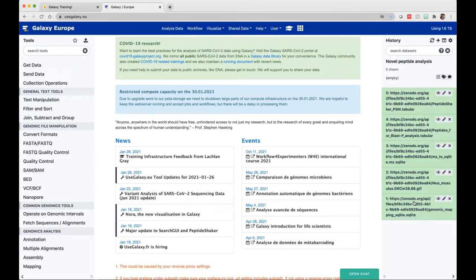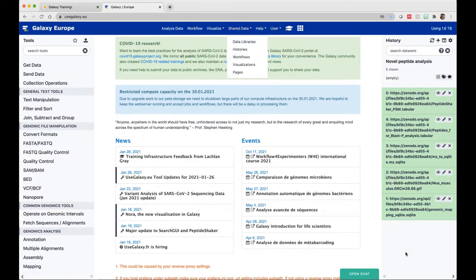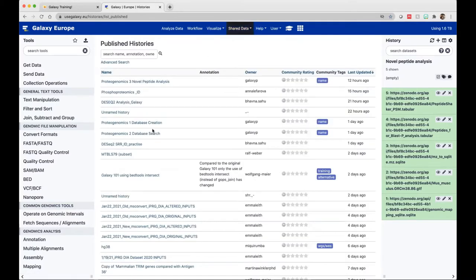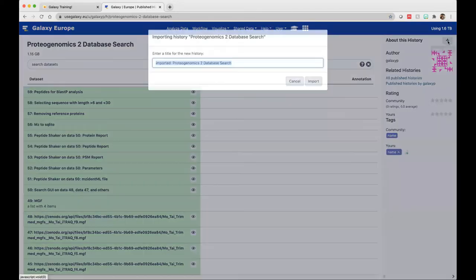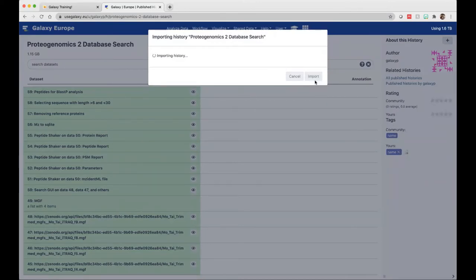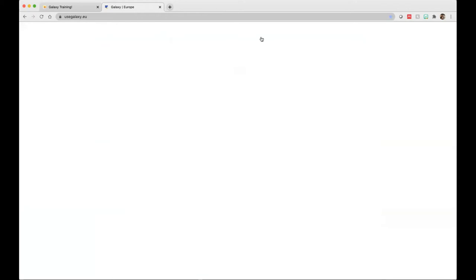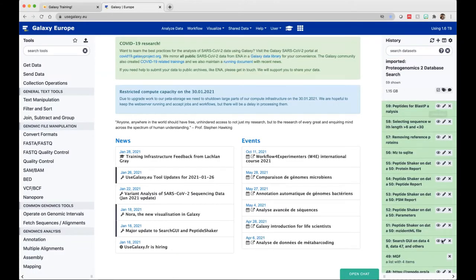If you have run the second workflow and have got an output, your history will be having more results. For the sake of running this third part of the tutorial, we have also shared histories. Go to shared histories, search for the Proteogenomics 2 database search, select it, and import history by clicking the plus sign. Once you do that, it will become your active history.